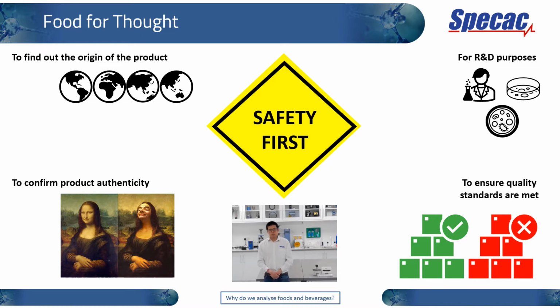So this information is very empowering and reassuring for the consumer, to help consumers make an informed, information-driven decision and to have more options. We also want to confirm the product's authenticity. Very often, a high-value product on the market is adulterated with a low-value product, which obviously is not very cost-effective for the end consumer buying the product. But more importantly, we don't want a product to be adulterated to contain any harmful substances that endanger human health.